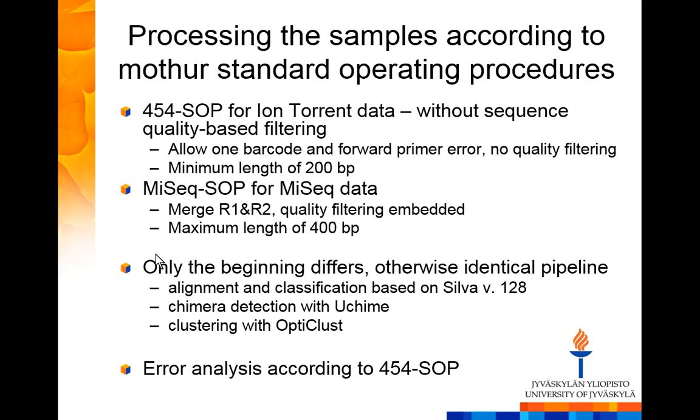And then if you want to see how I did the error analysis, you can find the definition in this 454 SOP. There they do what I did. Just a couple of commands. I can also give you all the commands that I use, because there is nothing new or nothing strange. So if you want just a text file, just ask me.